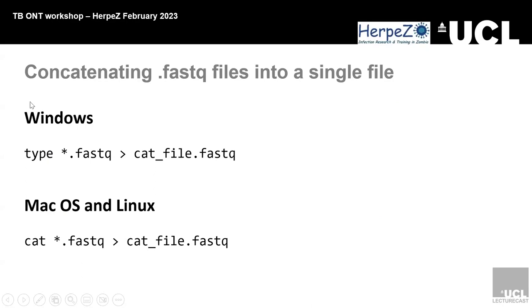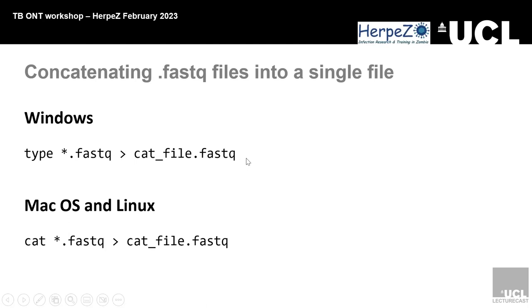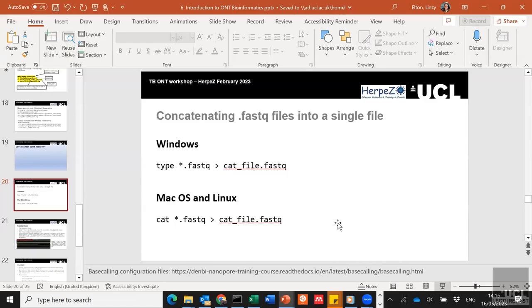What we need to do is concatenate those fastq files into one single file. I'm using a Windows computer, so the command is 'type', which combines those files together. Asterisk dot fastq, so that's saying any files with the ending fastq in this folder are going to be put into this final file call. I'm going to call it concat_file.fastq. For Mac and Linux, it's the same principle, but the command is 'cat' rather than 'type'.